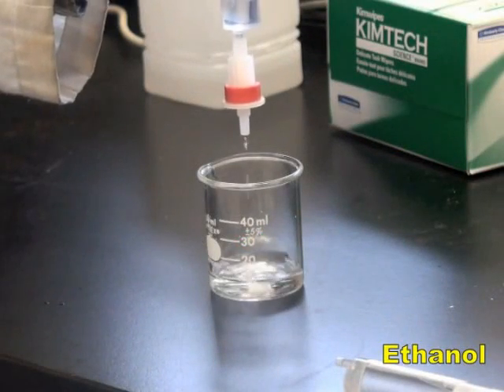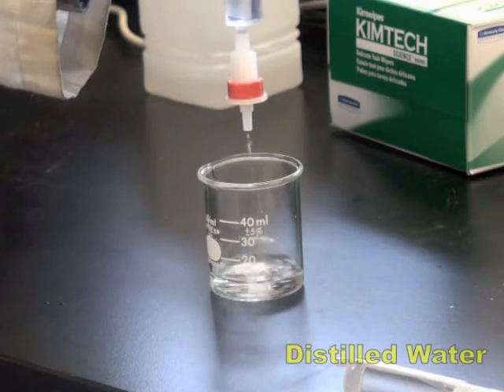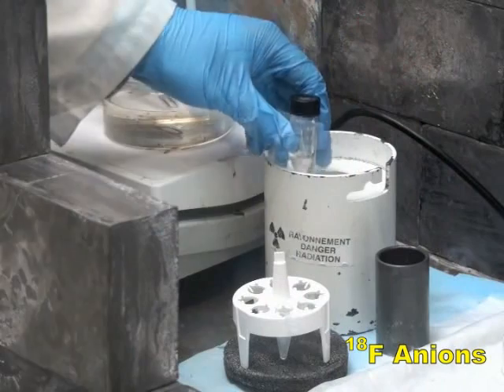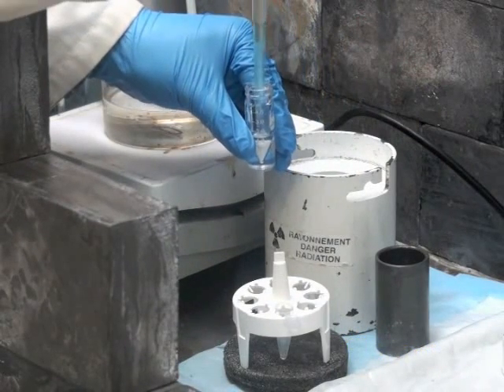Pre-condition a C18 Sep-Pak light cartridge by subsequently rinsing it with ethanol and distilled water. Add the fluoride-18 anion to a solution containing the SIFA peptide.